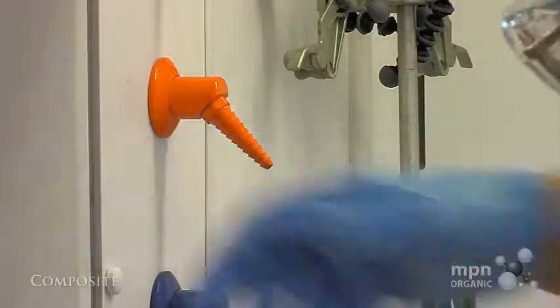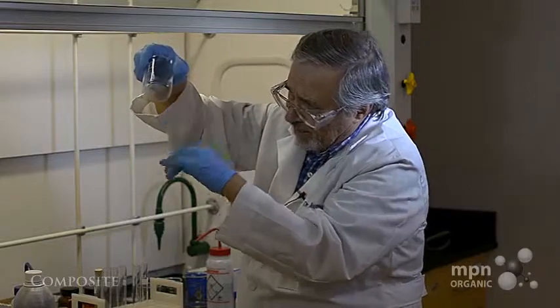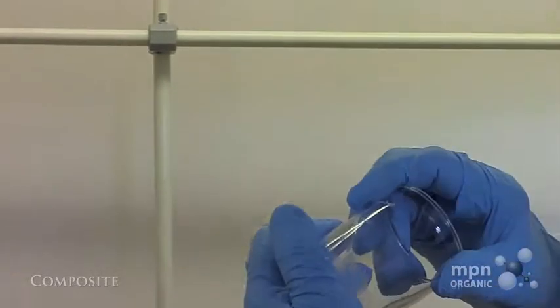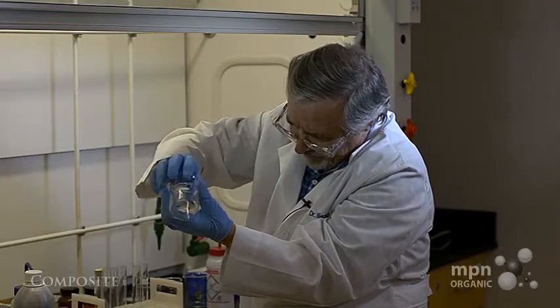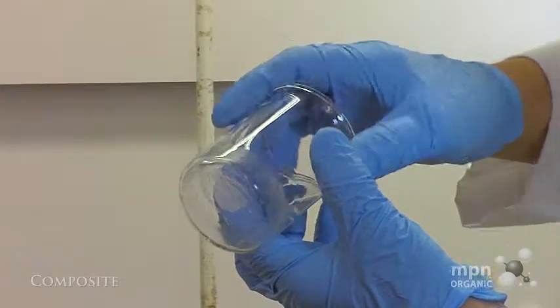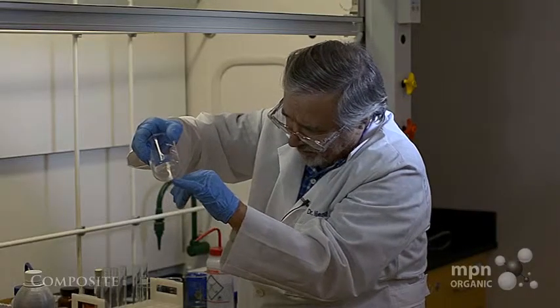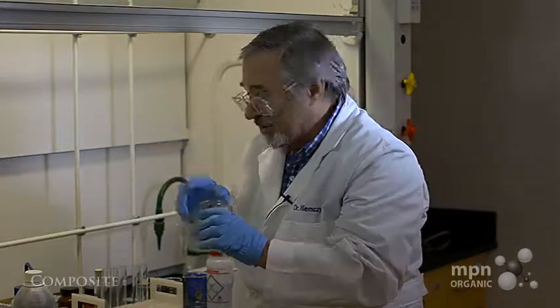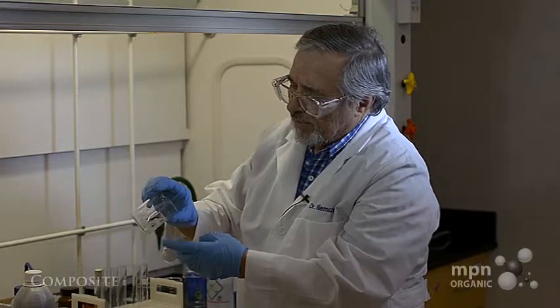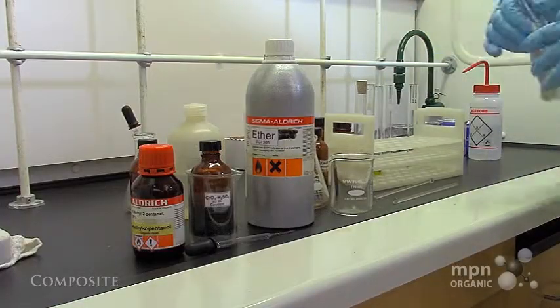Okay. All right, so it's not easy to see here, but we've got what's left over from the oxidation of the 4-methyl-2-pentanol to 4-methyl-2-pentanone. Okay, you can see it collecting along in here. You can even smell it. It smells pretty good. All right, so now we have our material in there. Let's see if it undergoes a 2,4-DNP test.